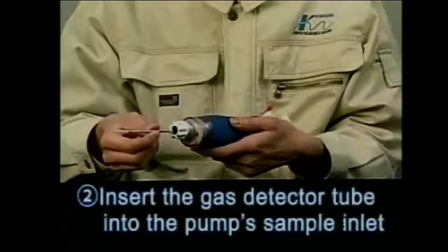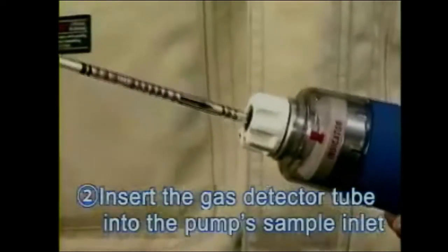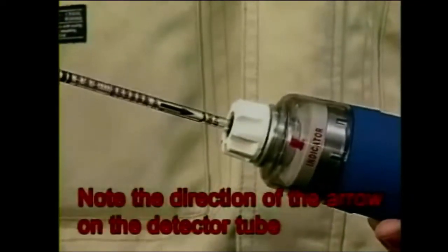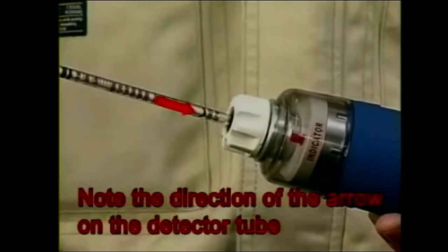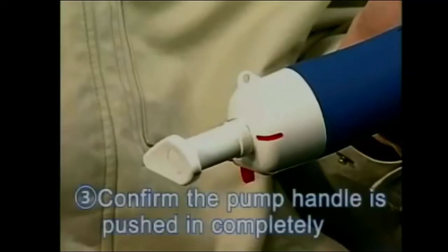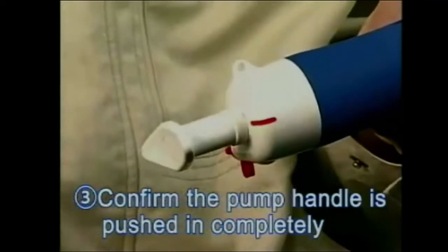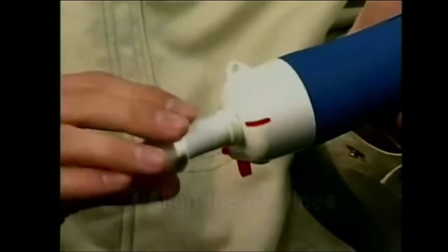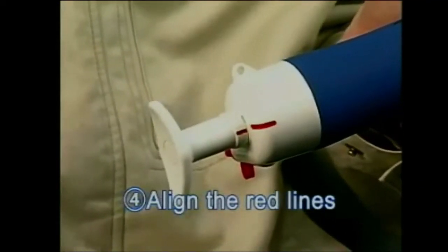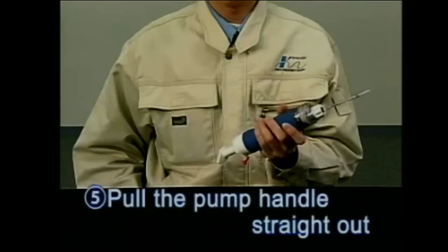Insert the detector tube into the pump's sample inlet, with the arrow pointing toward the pump. The arrow indicates the direction of the sample gas flow. Push the pump handle to confirm it is pushed in completely. Align the red line on the pump handle with the red line on the pump body. We are now ready to begin sampling.